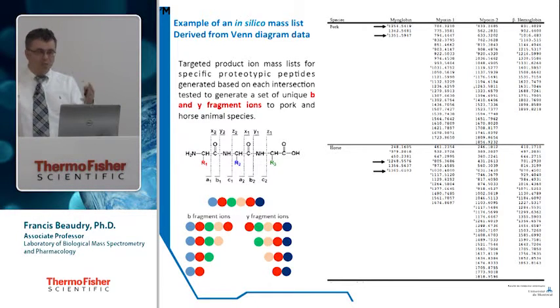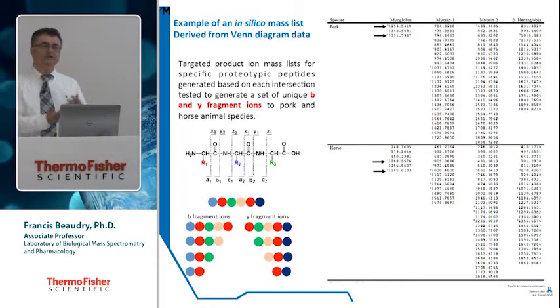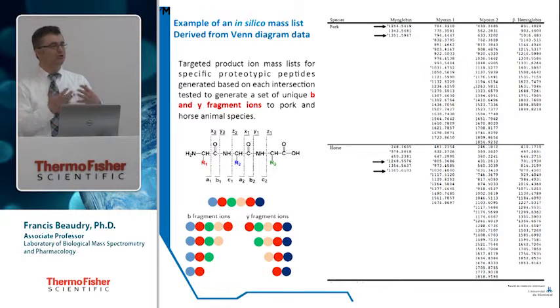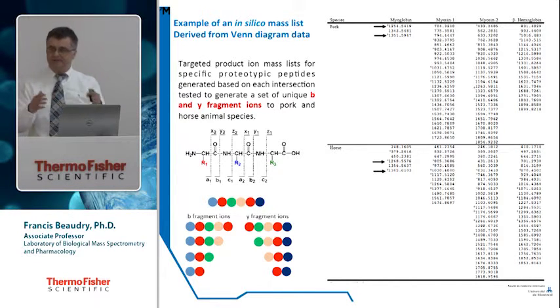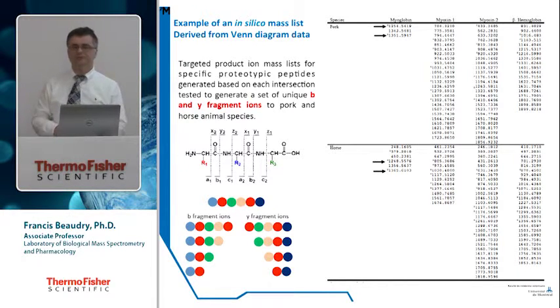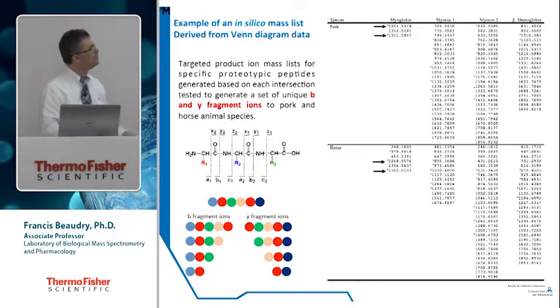When we look at it in more detail, peptides are always fragmenting with the same patterns, mainly with the type of instrument we are using, with a low to medium energy collision cell. We get Y and B fragments, mainly. Sometimes we do see A and X fragments, as well as C and Z fragments, but generally they are the least abundant in the spectra. So our objective is to be able to detect the peptides, so we're concentrating on the most abundant ones. So generally it's B and Y fragments.